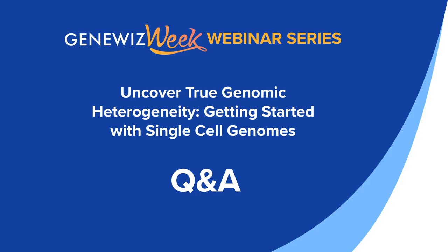Another question. Is the data that you showed in your presentation available for download? And how can I download it? Yeah, absolutely. On the 10x Genomics website, if you visit the page for the 10x single cell CNV solution, all of the literature will be present in there. Also, if you want to rewatch some of the slides during this presentation, we have put all the links that will allow you to access this data. Everything is available for downloading, and you can even try to play yourself with the data sets that are available.